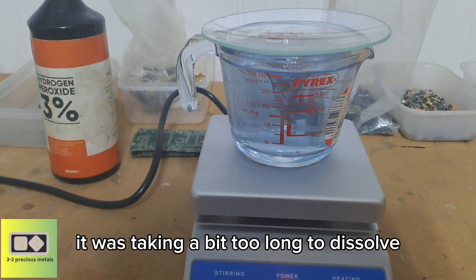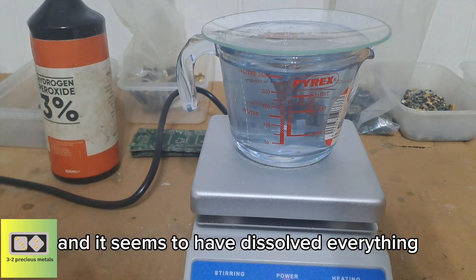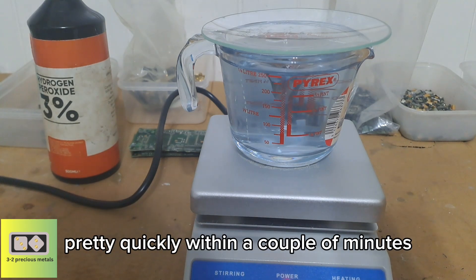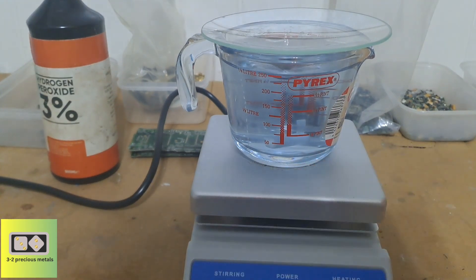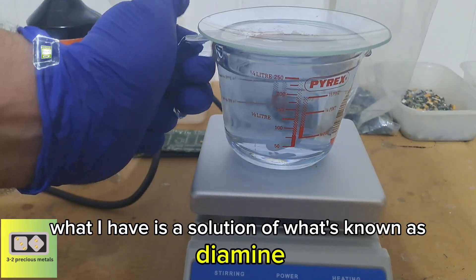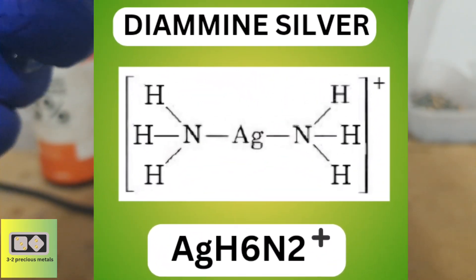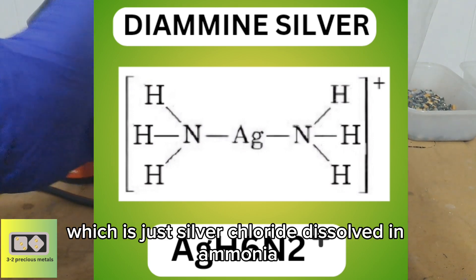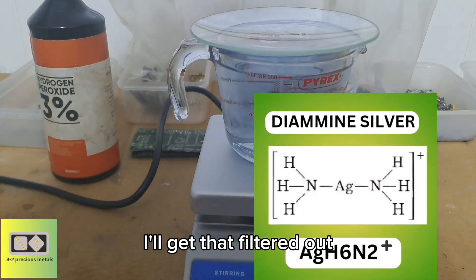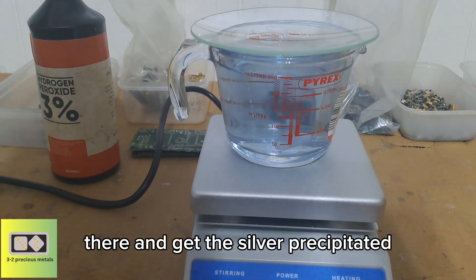It was taking a bit too long to dissolve all that silver chloride, so I filled up the jug to the 250ml mark and it seems to have dissolved everything pretty quickly — within a couple of minutes all the silver chloride was dissolved. So what I have is a solution of what's known as diamine silver, which is just silver chloride dissolved in ammonia.